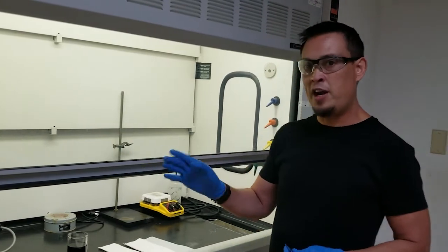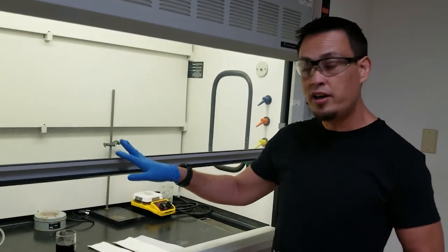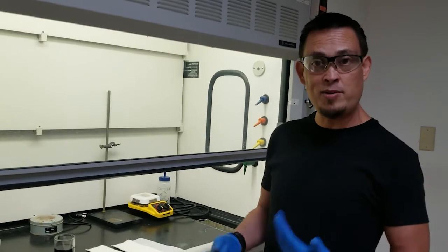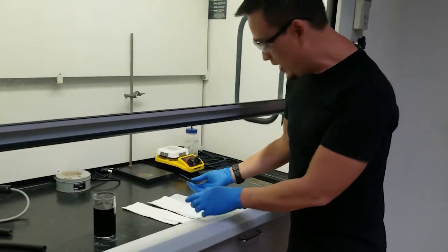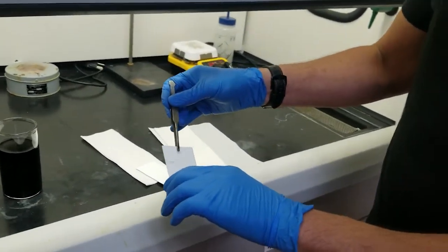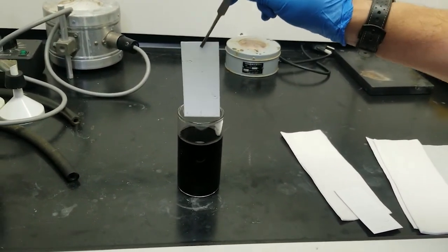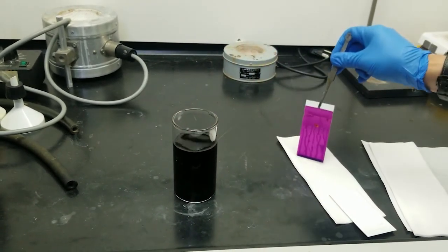It turns out that in order for a compound to be responsive to UV light, as we just saw, they must contain a chromophore, meaning they typically have a double bond in them. But what do you do if you don't have a double bond? How do we use TLC then? In that case, I'm going to show you guys that we could have done this instead of the UV light. You take your plate and you just submerge it into some potassium permanganate. So KMnO4, we just drop it in there and then take it right out and then tap it on here.